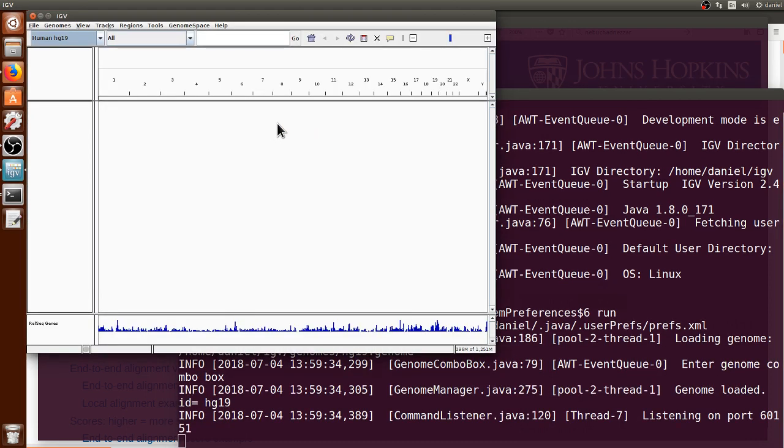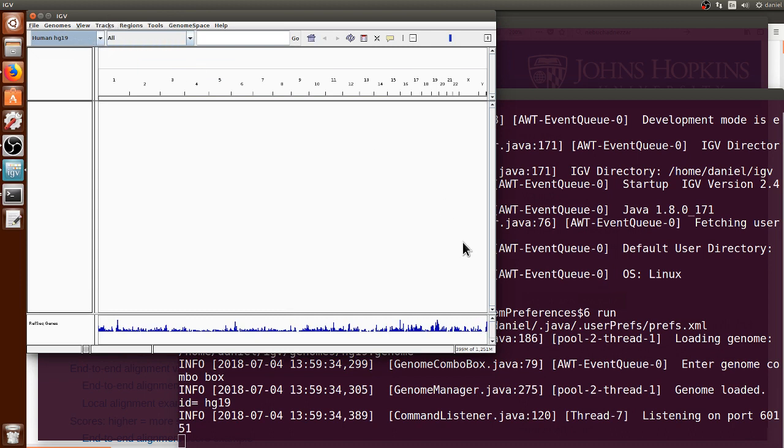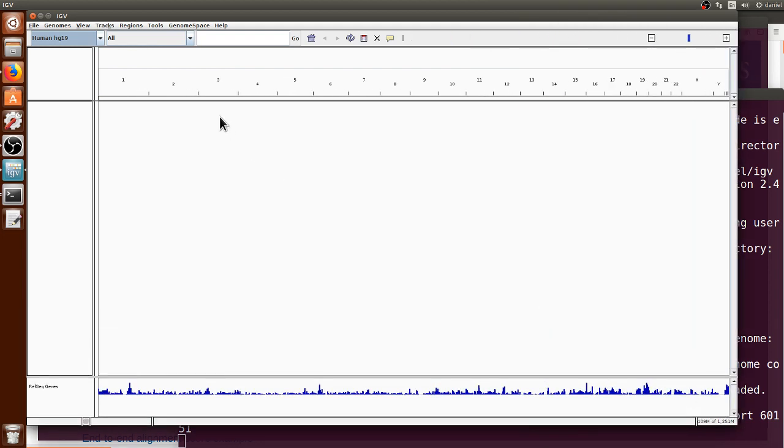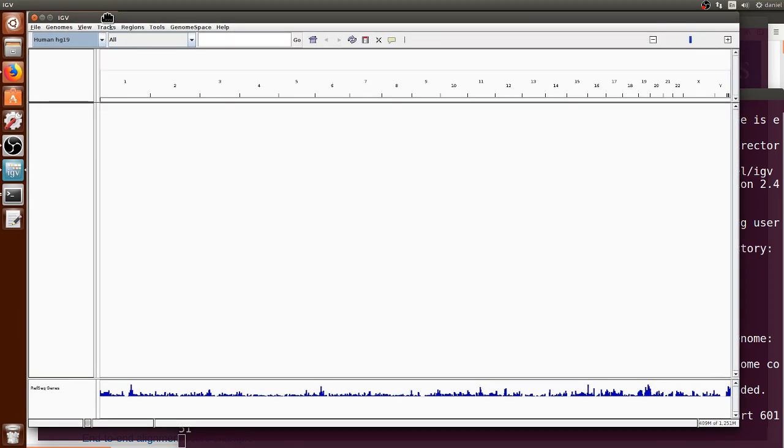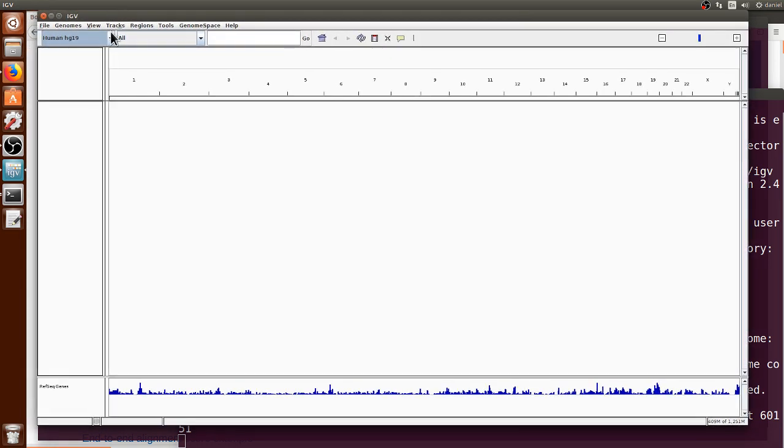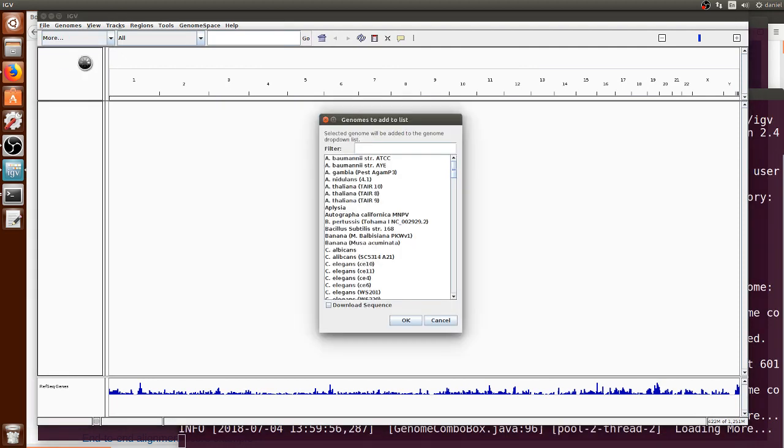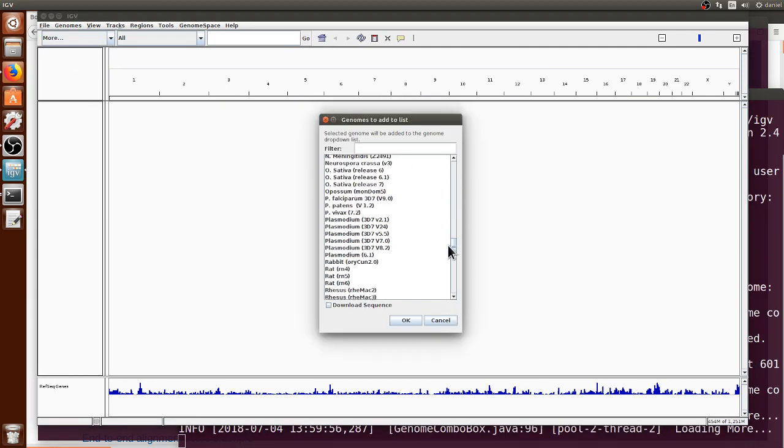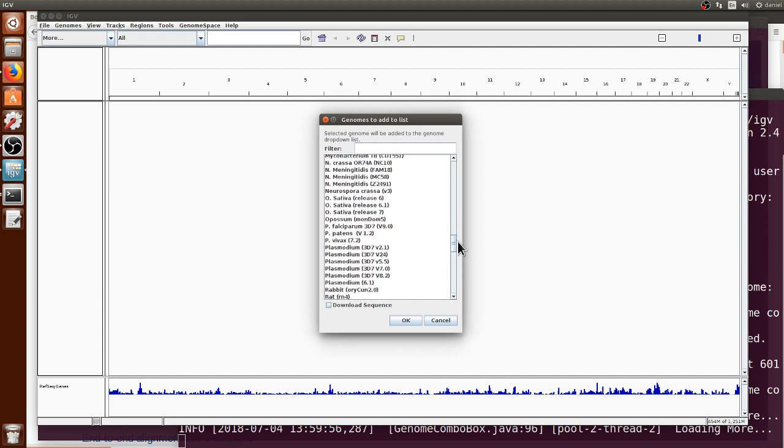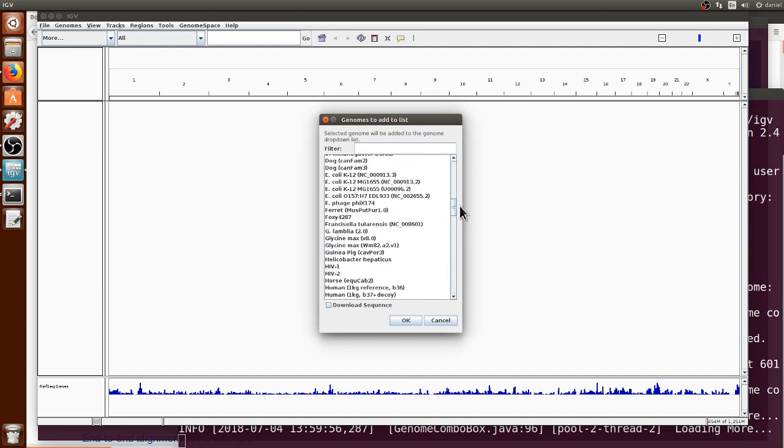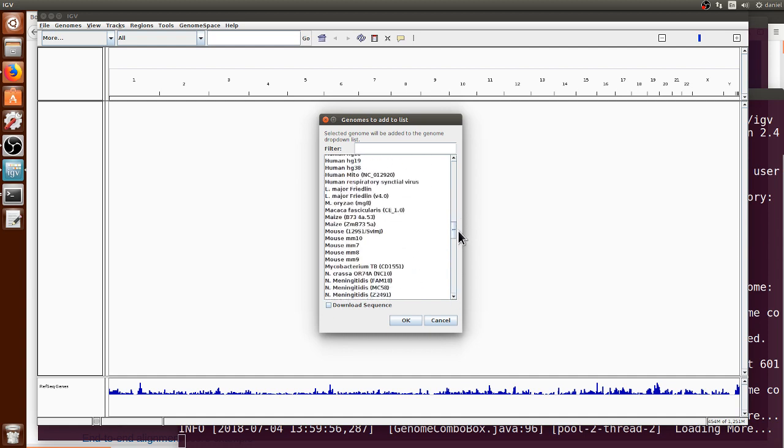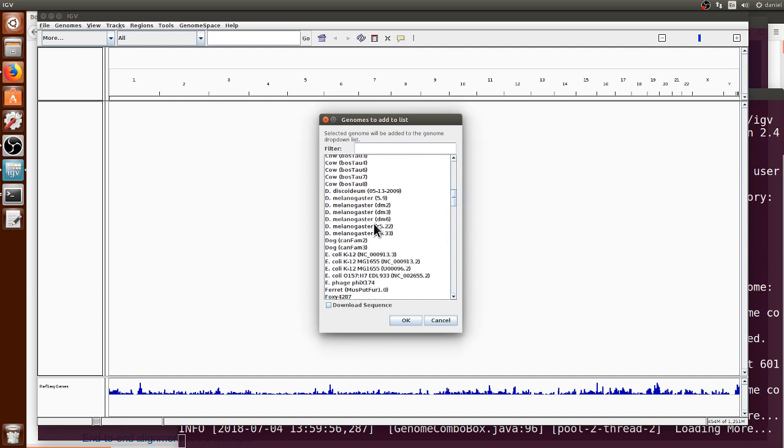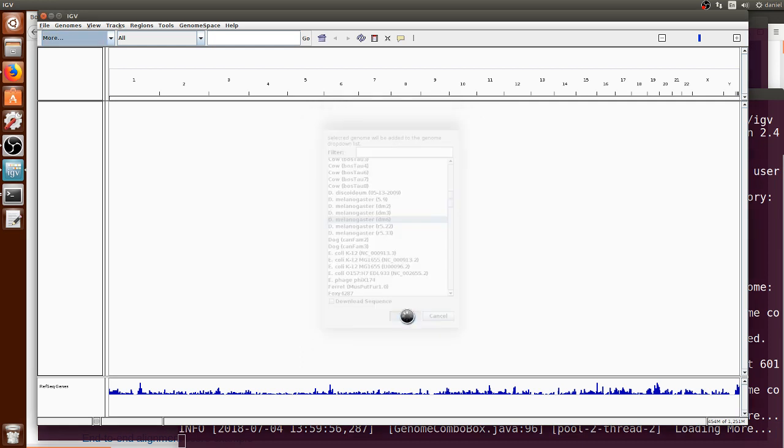We can make the IGV a little bit bigger and by default it opens the human assembly first but that's not exactly what we need. We will have to change to the Drosophila melanogaster because that's what our sequence reads are from. We can click it and there's a list here of many reference genomes that we can choose from. We can just choose the DM6 latest Drosophila melanogaster genome assembly.